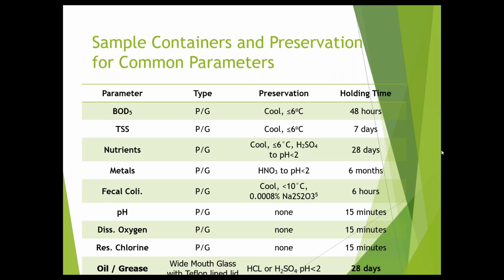Oil and grease. This is a specific one. Oil and grease must be sampled in a glass jar. Now, I was reading one of the comments and they mentioned that you can composite oil and grease. I'm pretty sure you cannot composite oil and grease, according to Standard Methods or the method that is referenced in CFR 136. And the reason you should not composite oil and grease is because, like everybody knows, oil sticks to the surface that you have it in. It floats, so as the water's poured off, it sticks in the container. So oil and grease is sampled in a wide mouth jar.